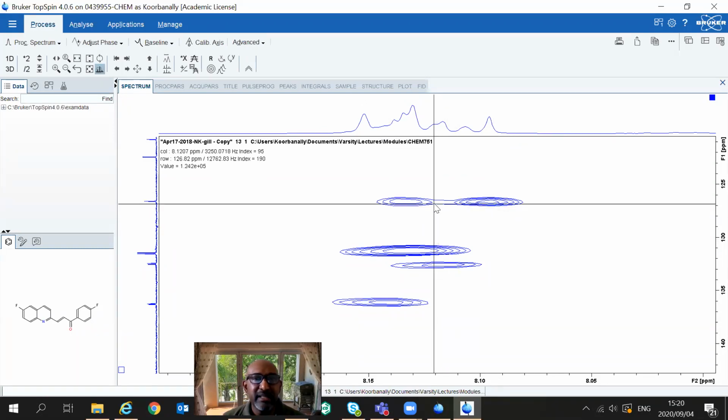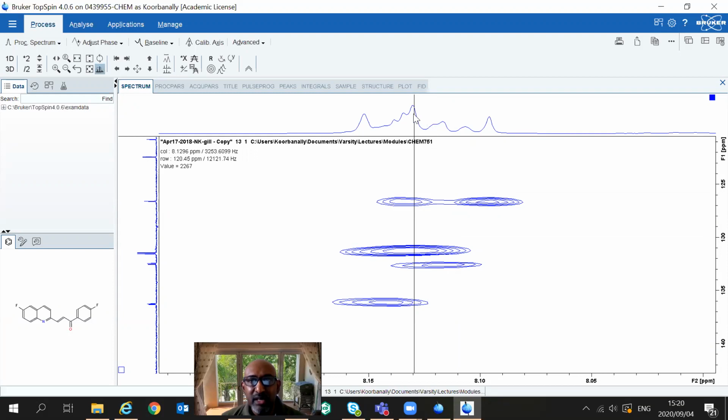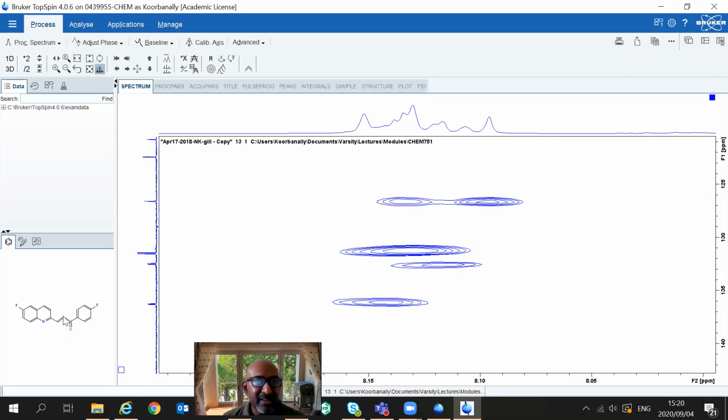You can see now that I can very cleverly look at this particular peak and this particular peak and tell you that the doublet is for one of these carbons, right? That's the carbon atom for one of these carbons here. I know that because it was the only one very far away from the fluorine atoms.